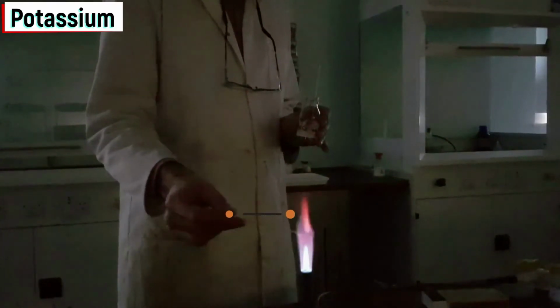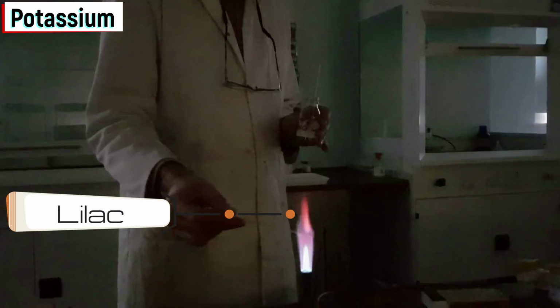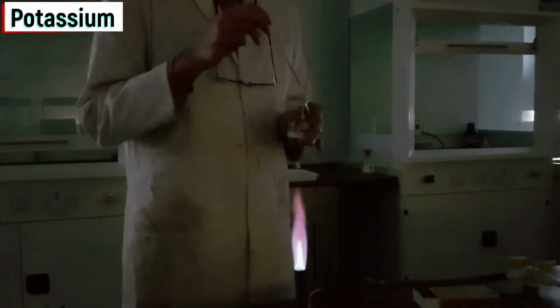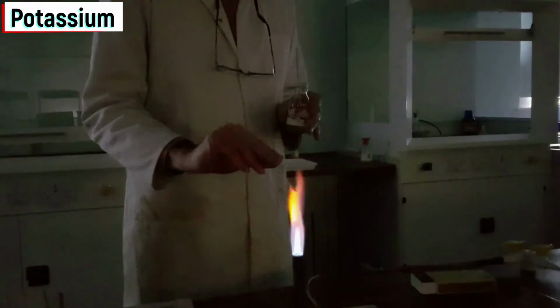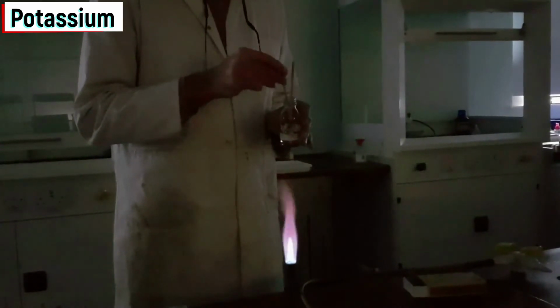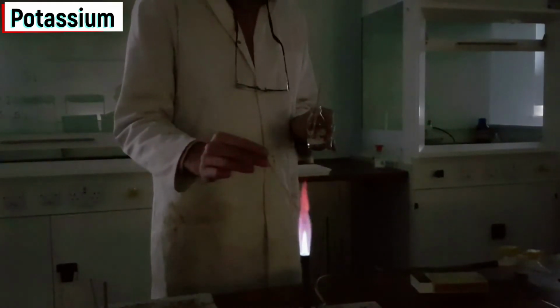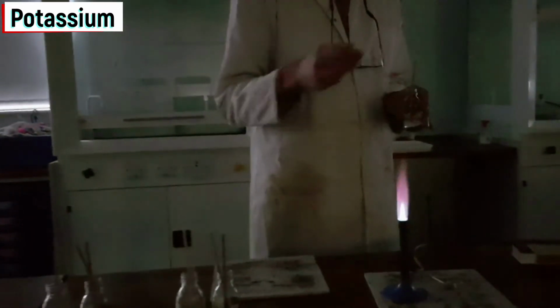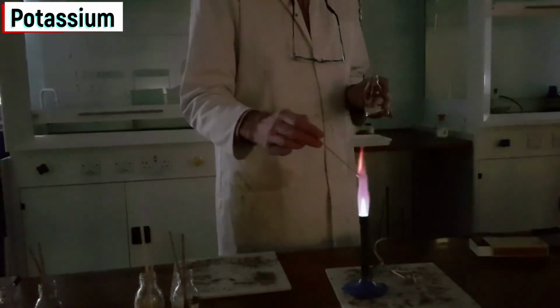So we're now going down to potassium. Potassium. Potassium is one of the hardest to see, but maybe you can see flashes there of the purple colour. We wouldn't describe it as purple. Your exam board wants you to call it lilac. So whenever we see a lilac flame, we know that it is potassium burning, and you would have encountered this before in the Group 1 metal reactivity series, where we demonstrated the reaction of potassium and water, and the potassium would have caught fire and would have burnt with a lilac flame.